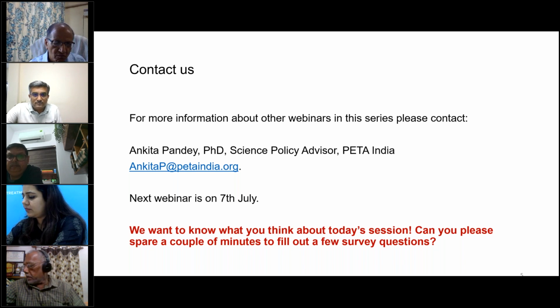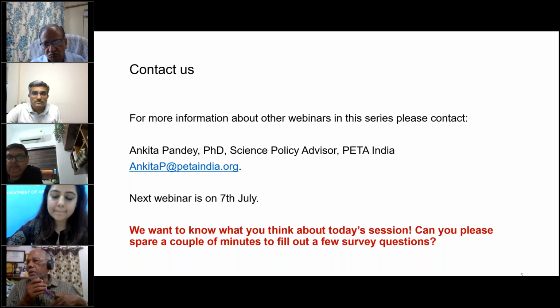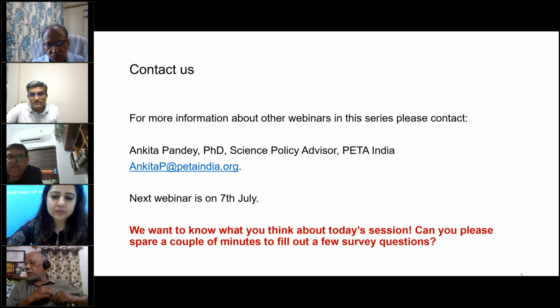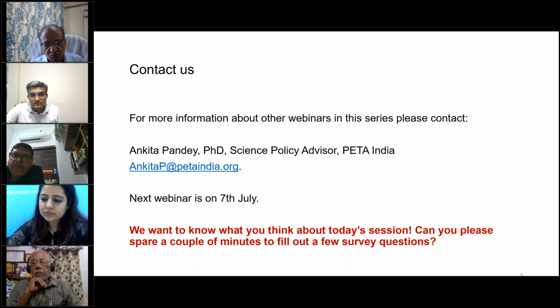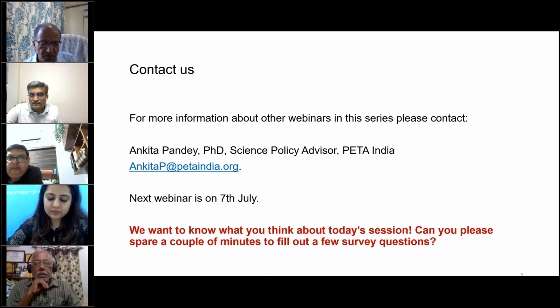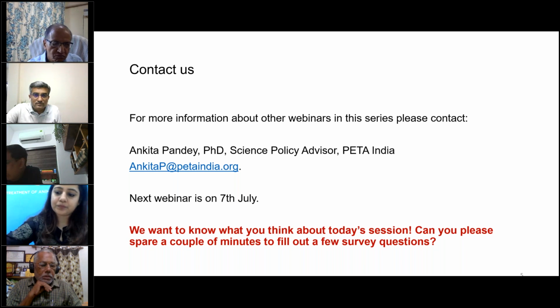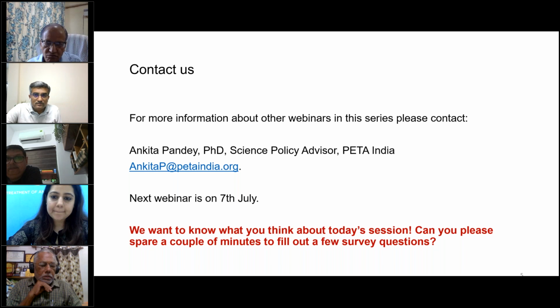Initially, we have a tie-up with a slaughterhouse in our city. Even before we plan the activity, we inform them that this many eyes are required for our testing. On the same day, we approach them, and there will be a person to collect those eyes, and we bring them immediately to the lab. We select the healthy cornea, and we reject most of the corneas because they will be either opaque or damaged, or they'll have some kind of defect. So from the slaughterhouse it will be a huge collection of bovine eyes, and we select the better and testable cornea, then separate the cornea from the bovine eyes and place them onto the holders. We plan the experiment on a single day, wherein the collection, selection, treatment, and analysis go on the same day.